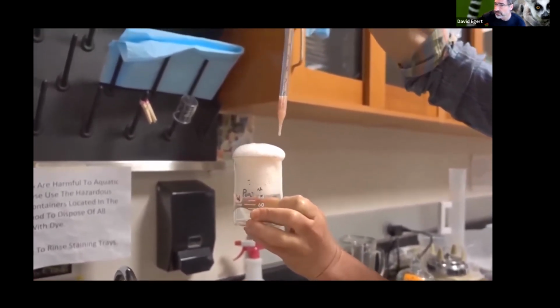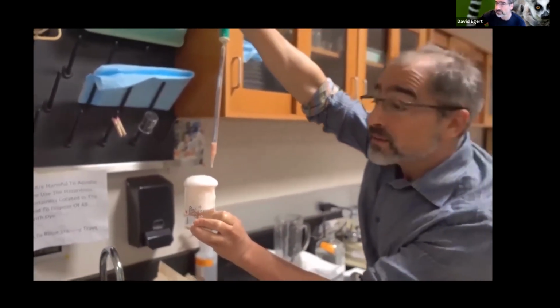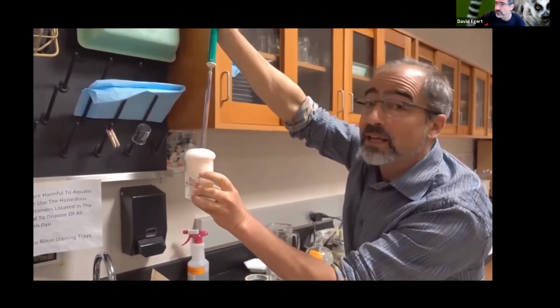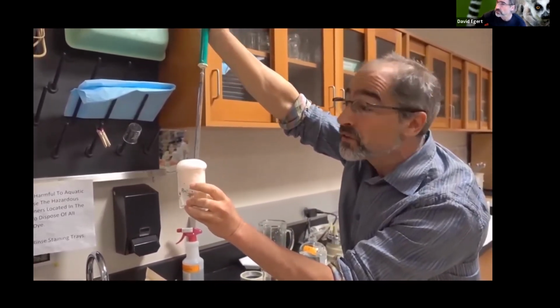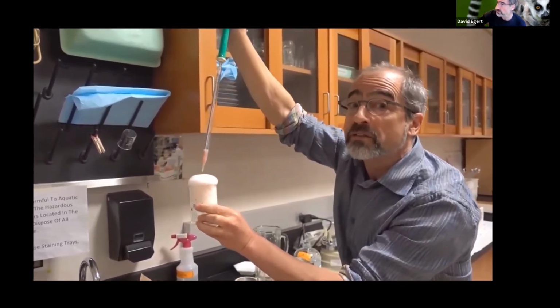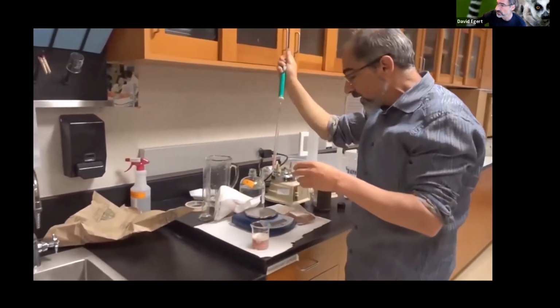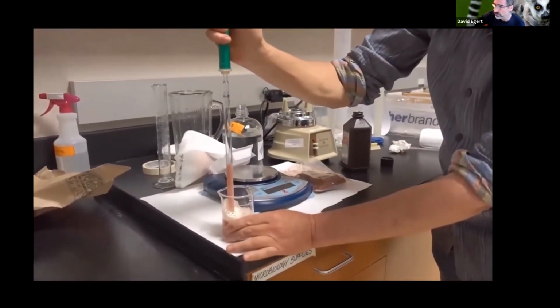The problem here is the reaction went really fast. Our intention in this is to measure the rate of the reaction, and if this thing just goes off like a bomb like this, we're not going to have a chance to actually measure changes in rate with different substrate concentrations and all. So we're going to have to dilute this quite a bit, like by a factor of 100. So that's the next step here. I'm going to take 4 mils of my solution here.